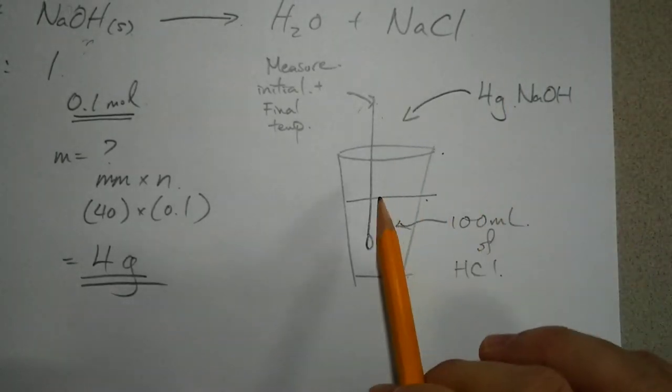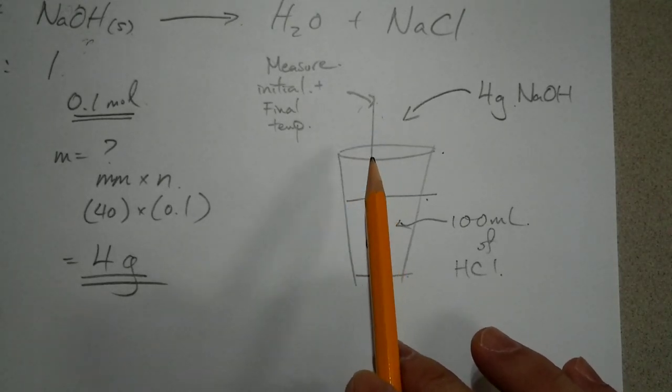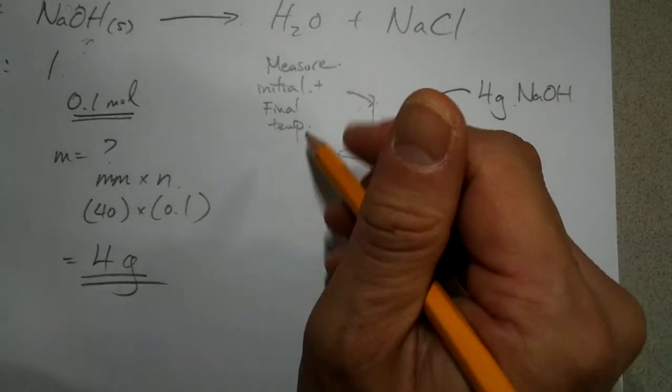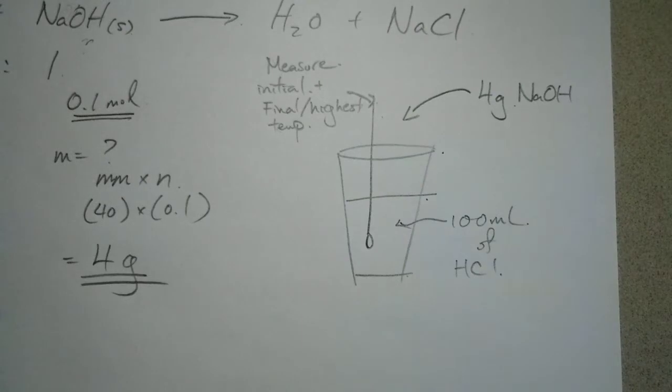You put it in there, and then you record the final temperature, or the highest temperature. Okay? And that's it. It's a very straightforward and simple lab.